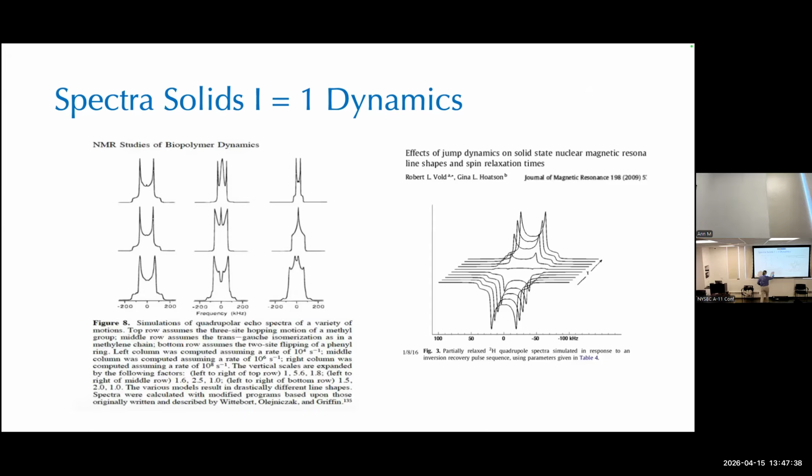If we plotted them to true scale, this would be the tallest, this would be about half that height, and this would be way down, because there's intermediate exchange going on and lots of lost intensity. So we blew them up to full scale.